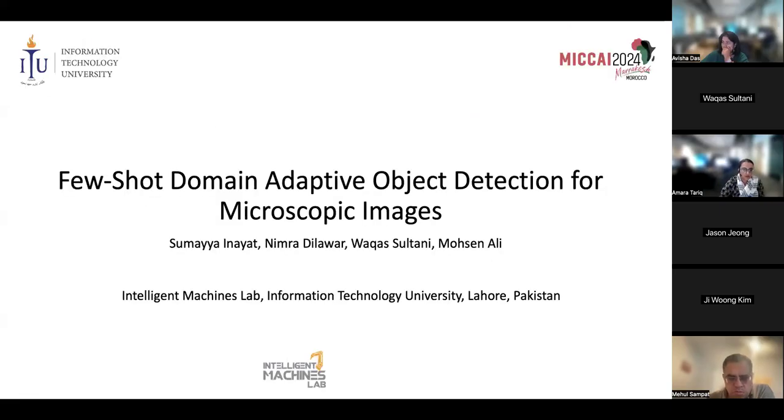So one of the challenges that we observed, as you might have guessed during the presentation, is that it's very, very hard to get the annotations. Doctors are willing to annotate on the high quality microscope, and for the low quality microscope, we have done it ourselves and then got it verified by the doctors. Obviously, we have the one-to-one cross models with the exact patch.